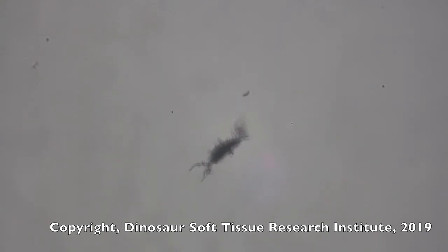We're not doing anything other than soaking these bones in EDTA to get them to decalcify. And after they decalcify, these cells are liberated.